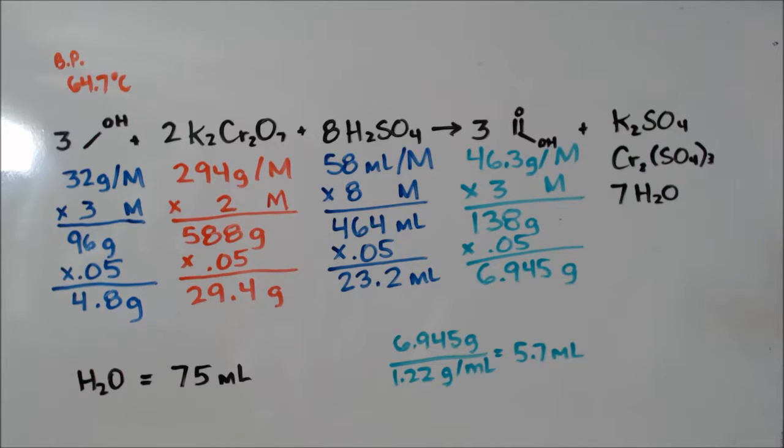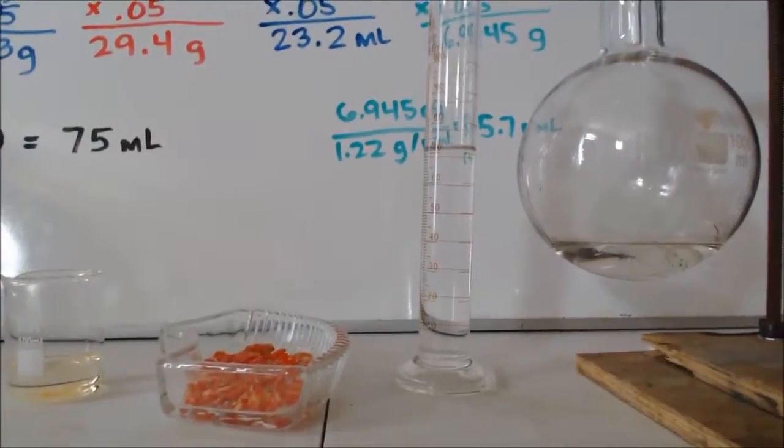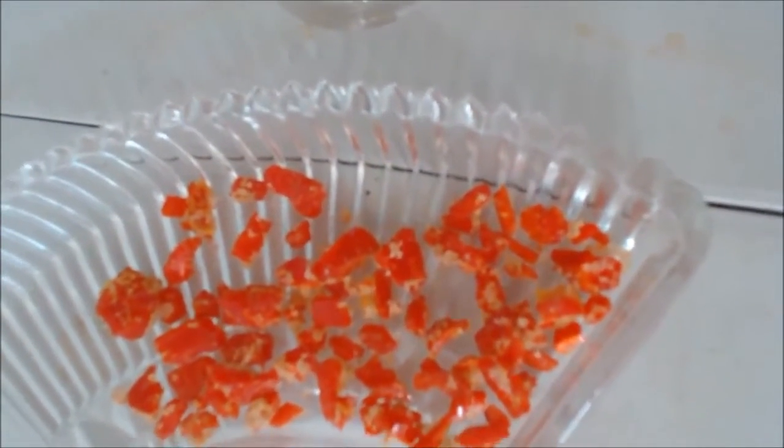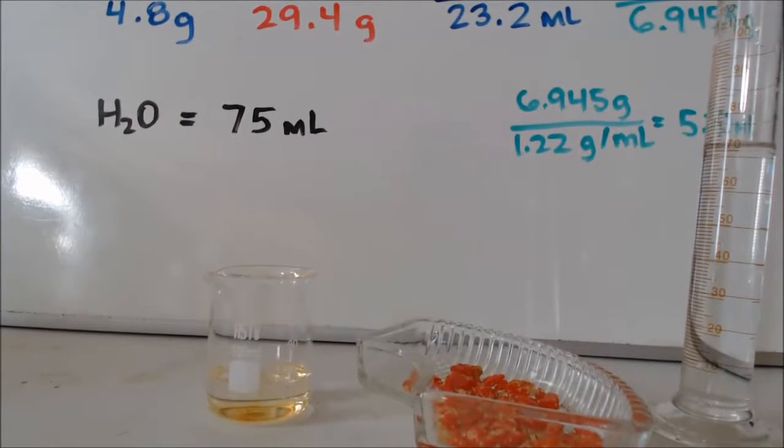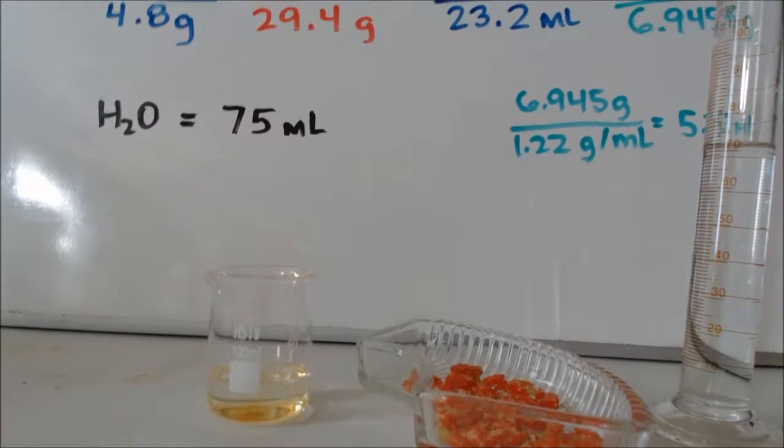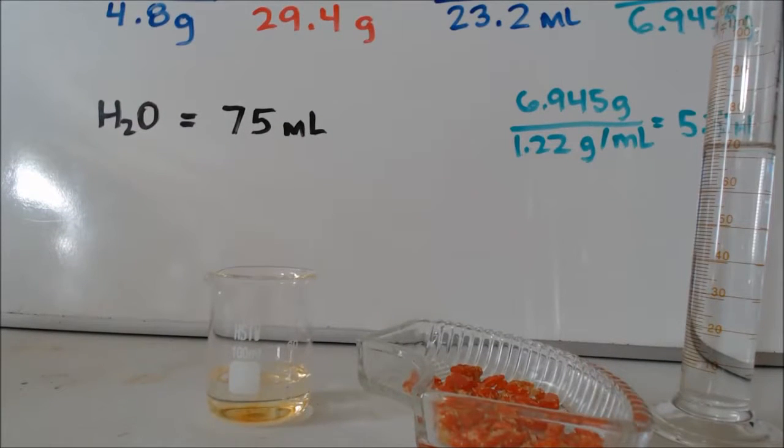Here's my chemicals for my chromic acid. I got 31.2 grams of dichromate, you can see that yellow stuff on there is chromate, and about 72 grams of water. I measured out 30 milliliters of sulfuric acid right here. The reason it looks dark is I had this chromate inside there and some of the dust was still in there, that's why it looks orangish brown.